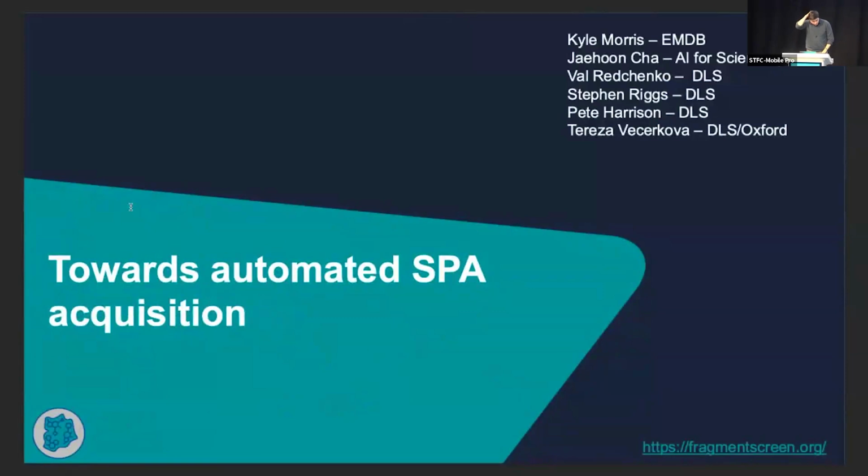So yes, now moving on to this project to try and see how we can move towards automating SPA more completely. I've got a list there of people. Kyle, who is actually giving the next talk now at the EMDB, started this project off while he was at eBIC. Jaehoon from SDFC's AI for Science group has done a lot of machine learning work with us for this project.